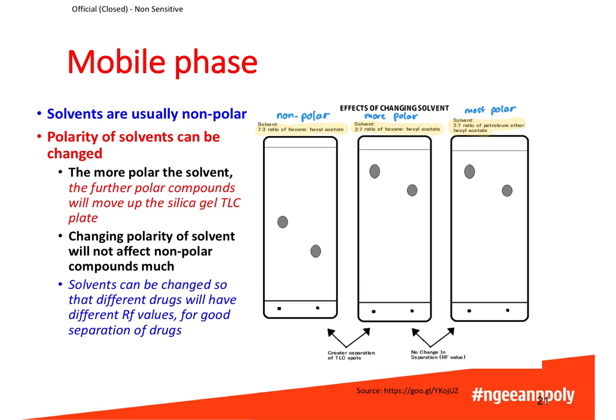to be analyzed. So between these three TLC plates and the three solvent systems, which is the best solvent system to achieve a good separation between the two compounds? The answer would be the first solvent system, because if you look at the first TLC plate, the distance between the two spots is actually quite different. The RF values are quite different, so you can achieve a good separation of the two compounds. Whereas if you look at the other two plates, the distance traveled is quite similar and the RF values are quite similar, so it does not achieve such a good separation between the two compounds.